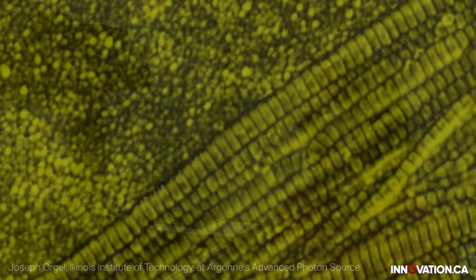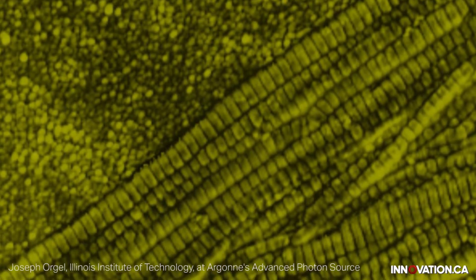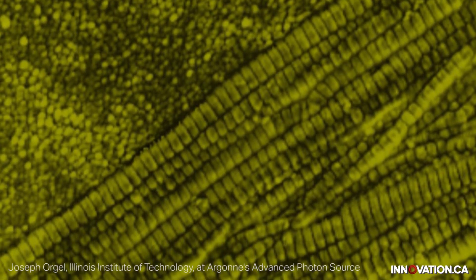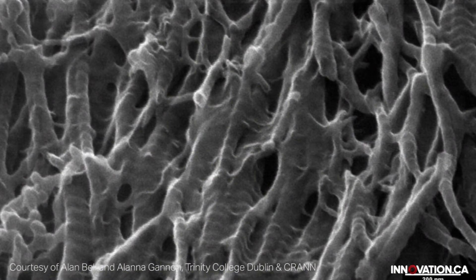What are the forces and how are they evolving in time? Marjan is using this instrument to look at collagen as it starts to assemble into fibrils. So this is the first stage in forming the extracellular matrix or connective tissues.